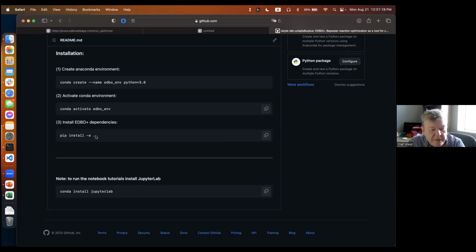Yeah, because some people already have internal workflows, so they might be interested in tying it in there. Obviously, you want to make things as easy as possible for the synthetic chemists. I mean, Abby knows this already, but I think most companies have their version of this already in operation. Most of the big companies we've talked to, some are using Abby's code, and some are using modified code already. Is that right, Abby? That's been my experience. Yeah, I think that's right.